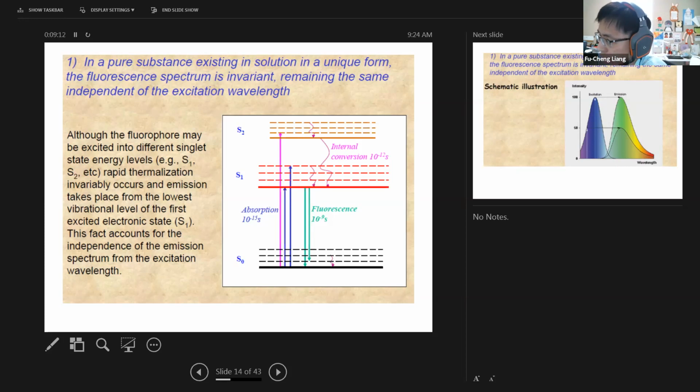So once you shine the light on the molecule and it goes to the excited state, this molecule undergoes thermal relaxation, also called internal conversion. The internal conversion basically is not going to emit any photon, all right? So those basically just release energy as heat. So when they're in the excited state, they release this energy as heat, and very, very quickly, like 10 to the minus 12 seconds, migrate into the first vibration level of the excited state, which is the solid red line S1 state.